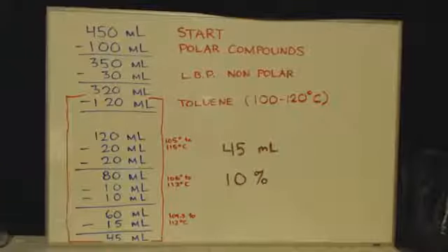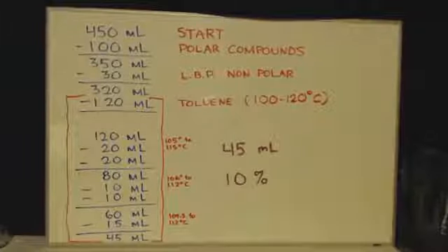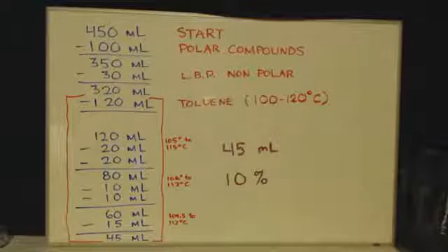Now, you can see right here, I distilled that again between 105 and 115 degrees Celsius, and I got 80 milliliters. I did the same thing basically because one of those, I can't remember which one, if it was the first or second, one of them wasn't a very good distillation, so I did it a second time. Anyways, I took the 80 milliliters down to 60 milliliters. Then I did the same distillation as before with the azeotropic one. I took 109.5 degrees to 112 degrees Celsius to get 45 milliliters. And that's what I got doing it with the azeotrope. 10% yield, so it's the same either way.